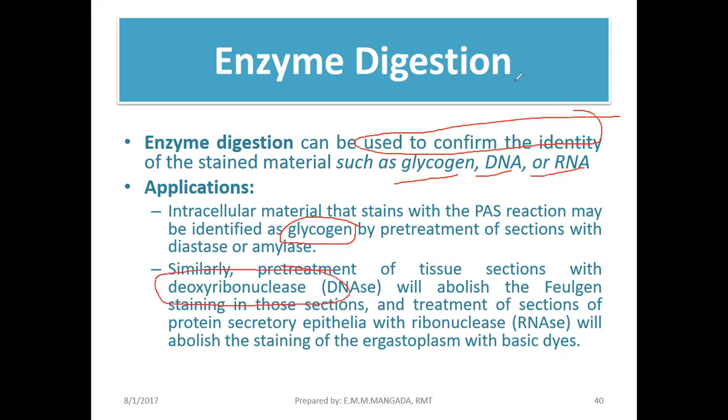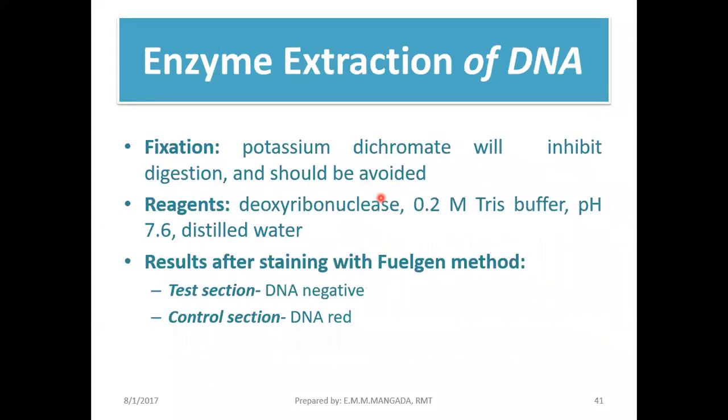Okay, we have here an example. Guys, I'm discussing an overview of these methods. This is not an in-depth discussion, because you will be discussing these dun sa mga higher subjects ninyo. So this is for you to be provided of basic ideas about the methods. So we have here the process. Ano yung enzyme digestion na tinatawag? Okay, from the term itself, enzyme extraction or digestion, we remove something to confirm the presence of something.